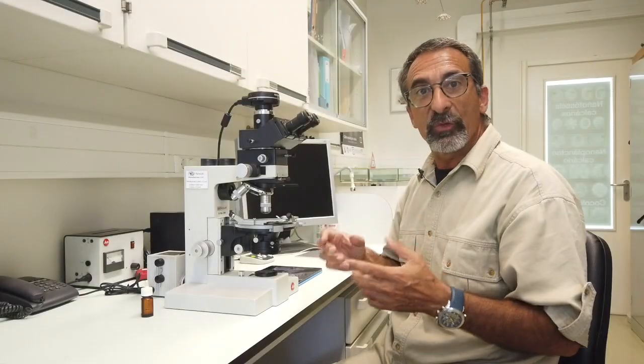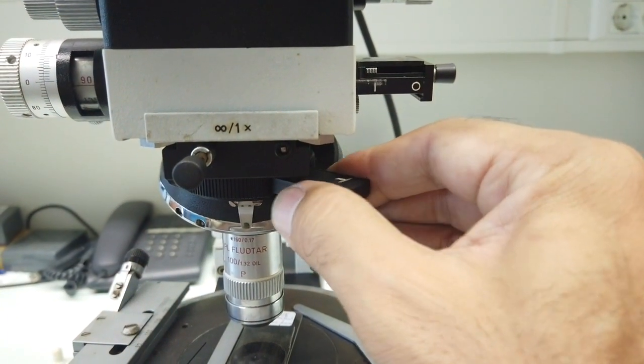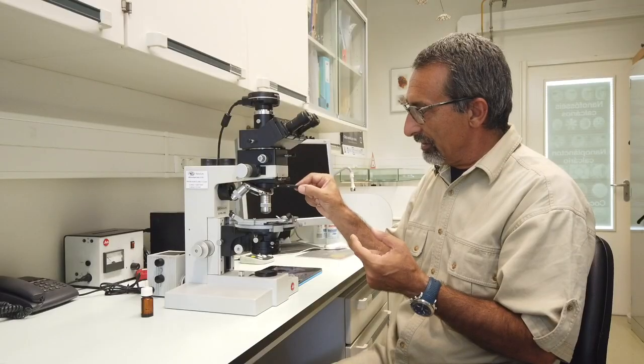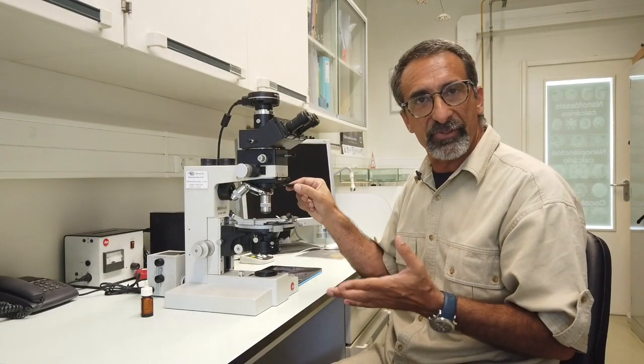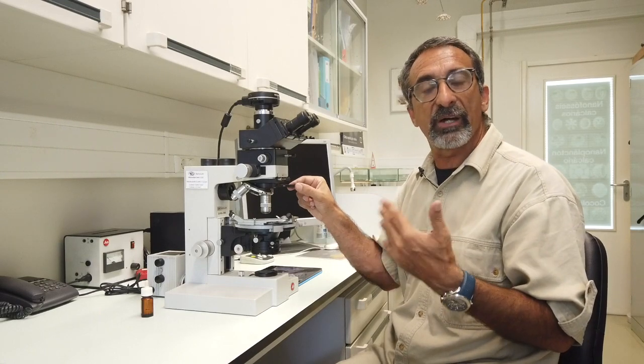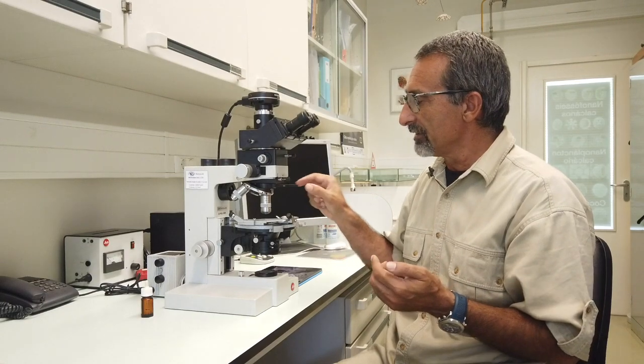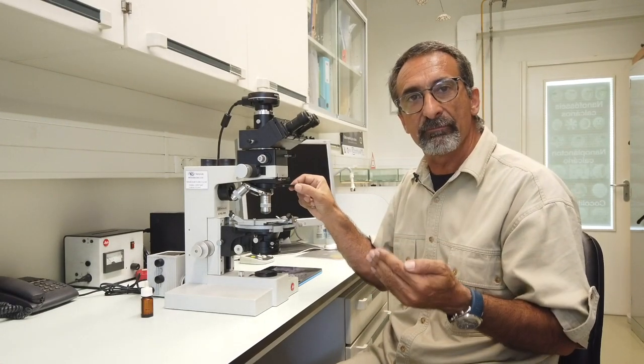And then we have here, this position, an auxiliary plate. This plate we'll see later on what is the purpose of it. In most cases there's no need for it, but in some cases it can be useful. In this case is a gypsum plate.